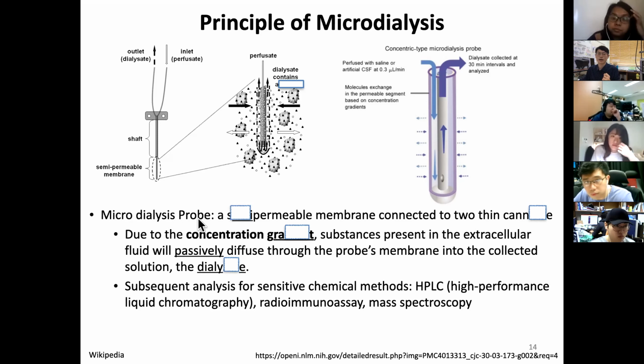So a microdialysis probe uses a semi-permeable membrane, which is connected to two thin cannulas. And we are talking about due to the concentration gradient.